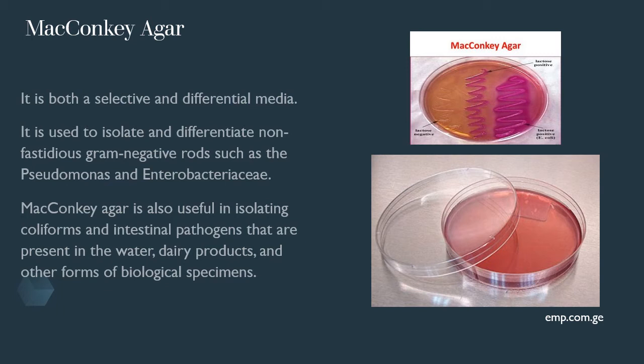Here in the picture you can see the below one is a sterile plate of MacConkey's agar, and above it the first picture shows a lactose negative growth, then a lactose positive, and another that is also lactose positive. There is a change in the pattern. The first, which is lactose negative, is completely colorless.